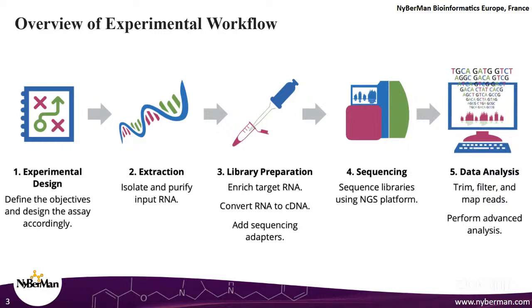for the sequencing run, right? The third step, after extraction, is that we have to prepare the library. Library preparation is one of the most key steps in an RNA-seq experiment, right? Our goal is always to enrich our target RNA, that is the type of RNA molecule we want in our analysis. Common steps include converting the RNA to complementary DNA and addition of sequencing adapters.